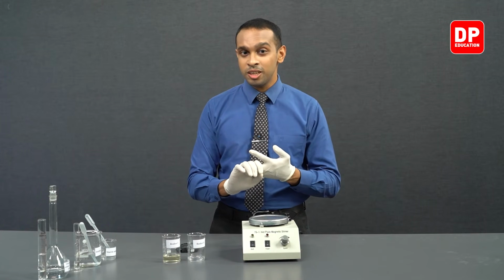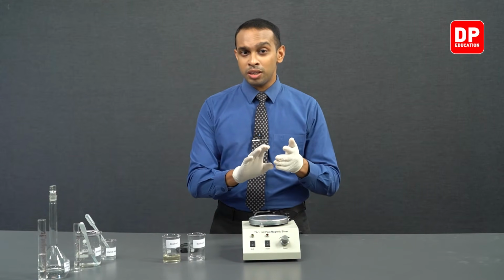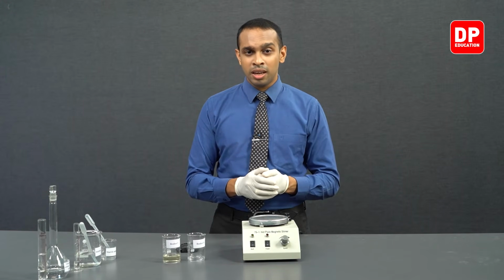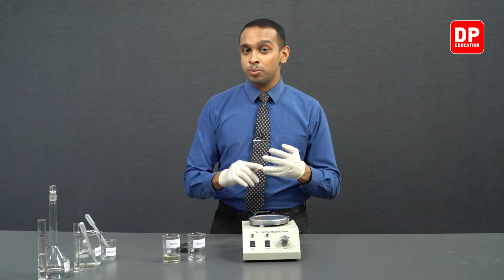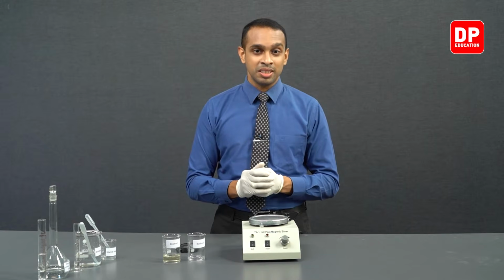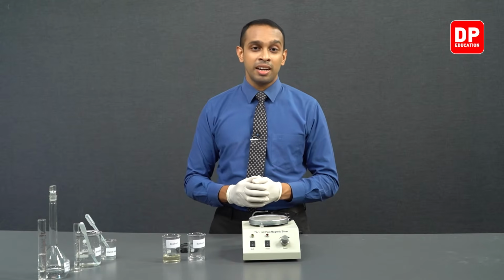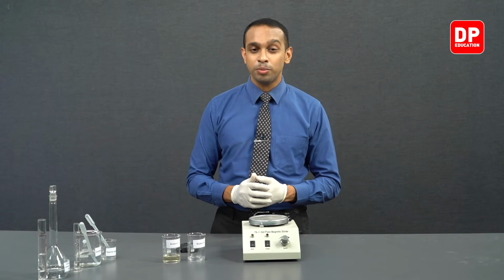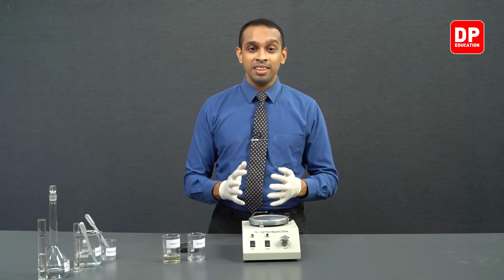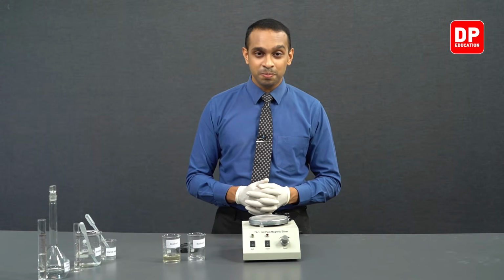However, from there onwards, we are going to be seeing if you bring down the volume of iodide ion solution to 8 cubic centimeters and then carry out this reaction. And the third one would be to bring down the iodide ion concentration to 6 cubic centimeters in the reaction mixture. And you're going to continually decrease the iodide ion concentration and observe whether the rate of reaction changes when we change the concentration of iodide ions in the medium.